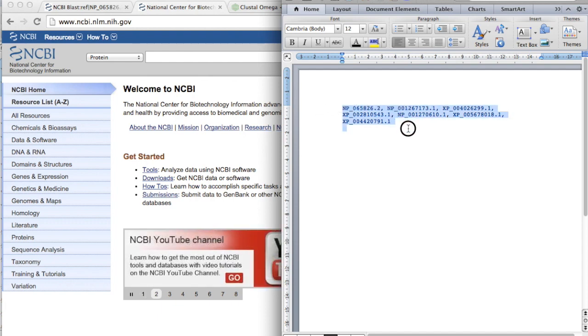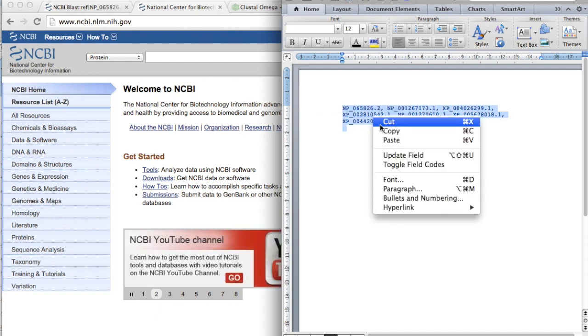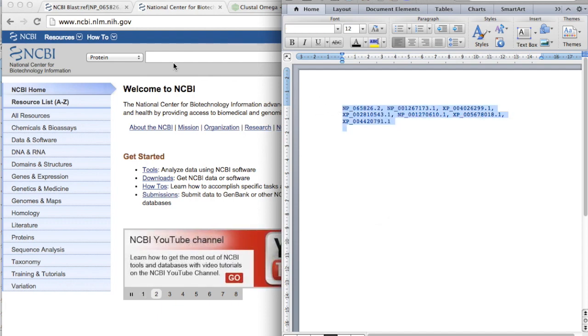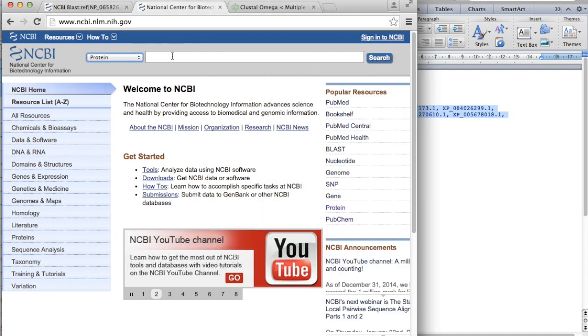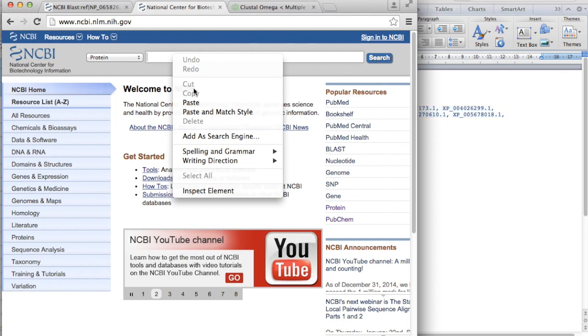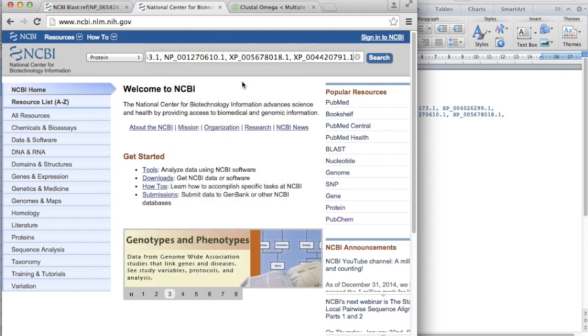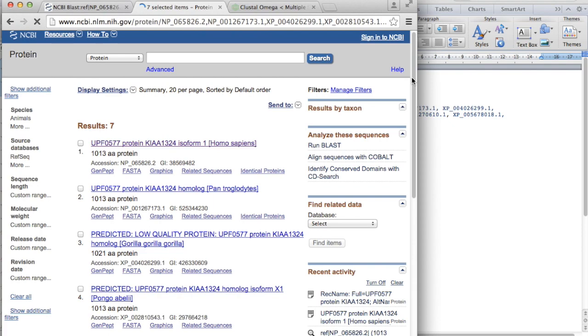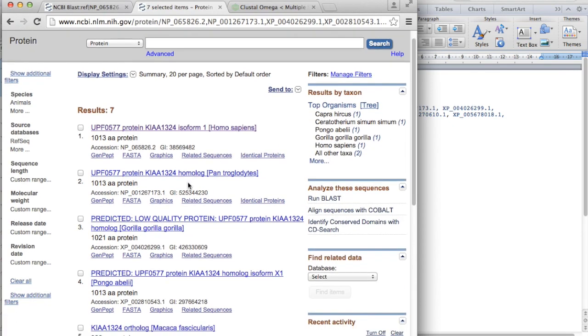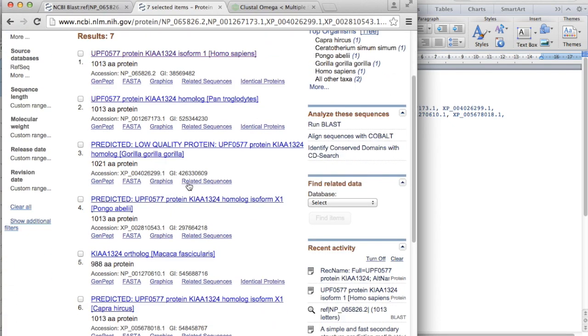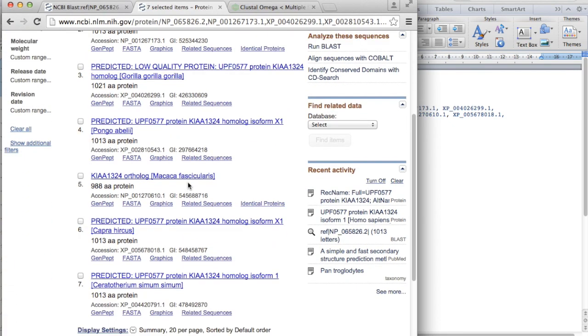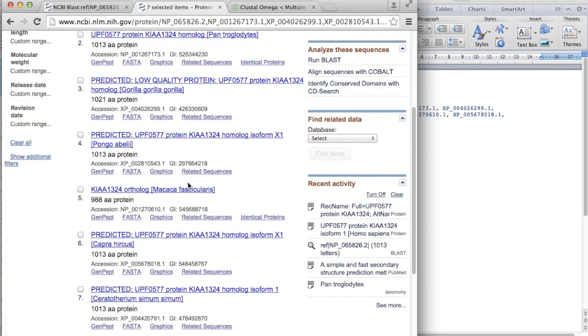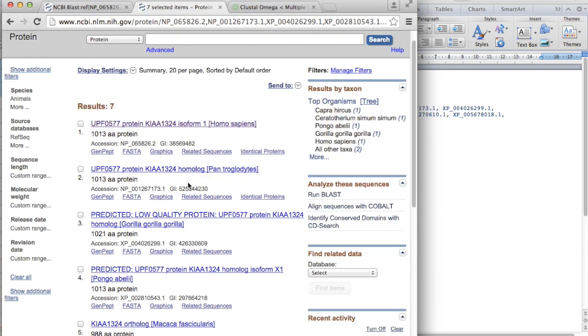And what we will do is to copy and put this here in NCBI and search. And here you can see the seven organisms that I chose.